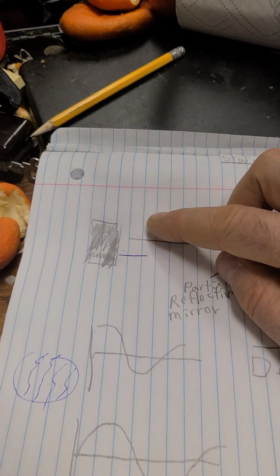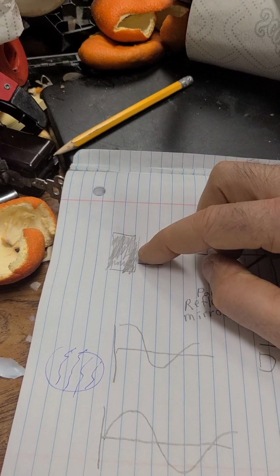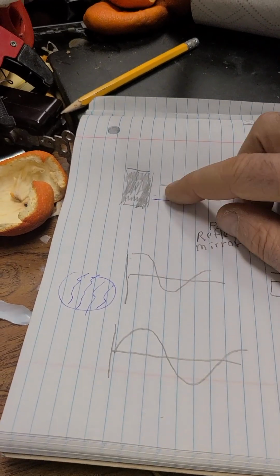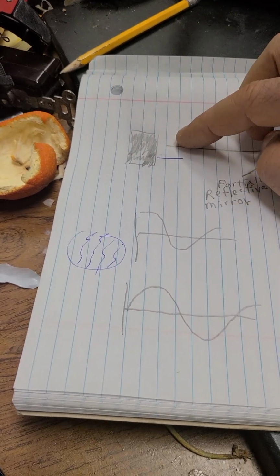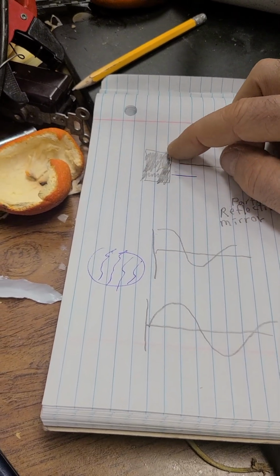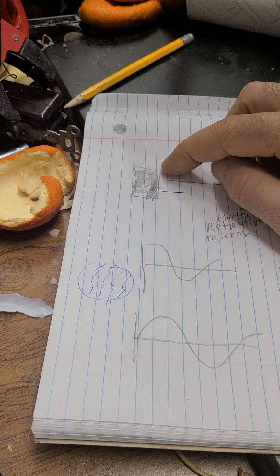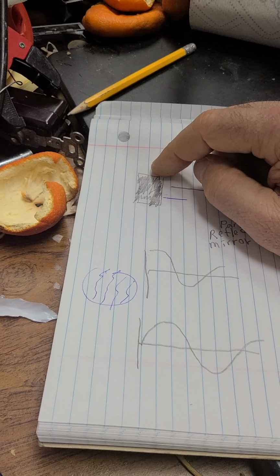So black body style radiation would be your emitter of radiation, a heated body which has some size, maybe a centimeter or something of that effect. Now, how can a black body have coherency in its radiation? The whole idea of black body radiation is if we went to one particular spot on its surface, the molecules are bouncing around in a Brownian motion pattern.